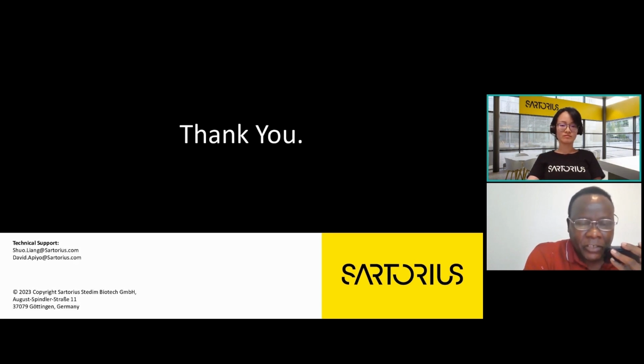Yes, this is actually a very good question. I think one of the biggest advantages of the Octet instrument is that it can support all the three commonly known epitope binning formats. This would include the in-tandem format, which is what Shuo has talked about in the webinar. In this format, the antigen is first bound onto the biosensor surface and is then followed by a sequential binding of the antibody pairs being screened.